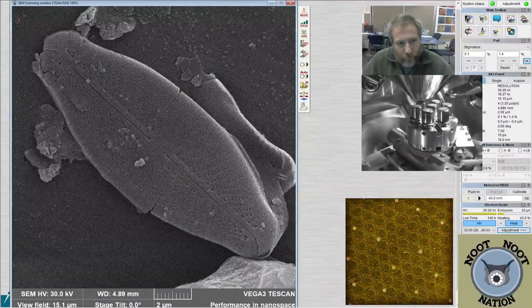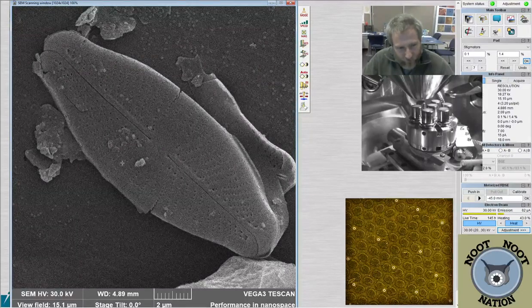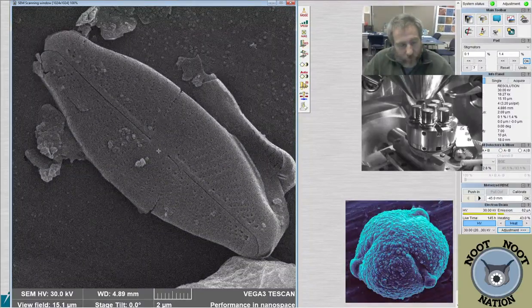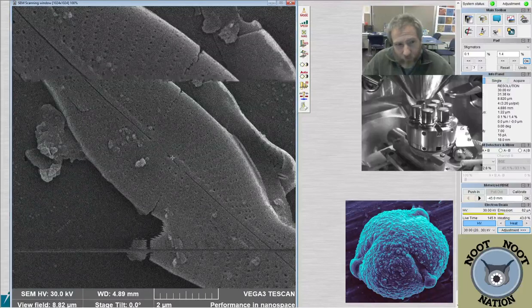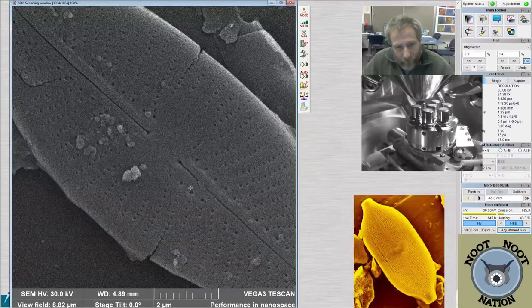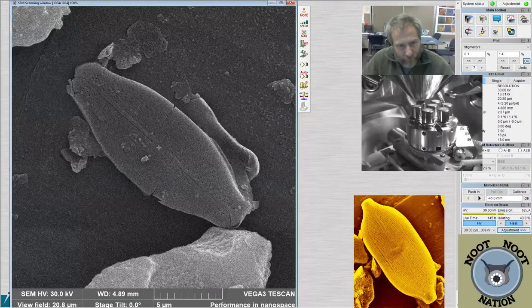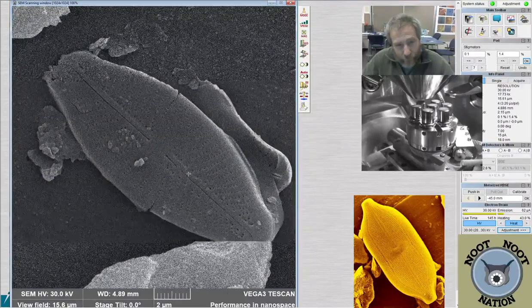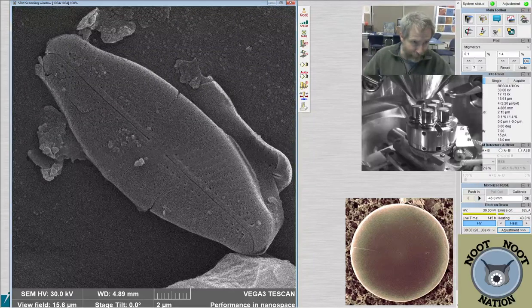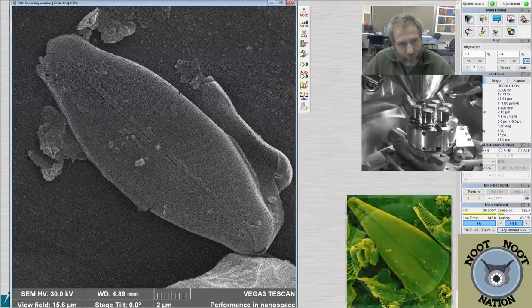Both raphe ends deflect in the same direction. There is a central area that looks like it's hyaline and sort of bow tie shaped, which is why I thought it might be Sellaphora, and also the raphe looks kind of Sellaphoroid, so I feel like it could be Sellaphora, but these really weird large pores next to the raphe are kind of throwing me off a little. Normally Sellaphora has a thickened raphe ledge on the outside of the valve, and then hyaline areas on the ends, which I think these actually have, so I feel like it's probably Sellaphora.